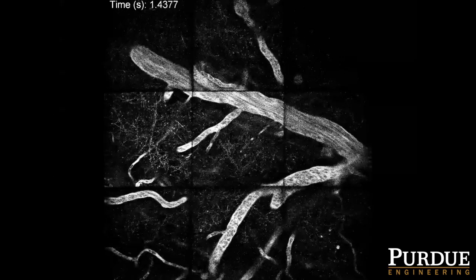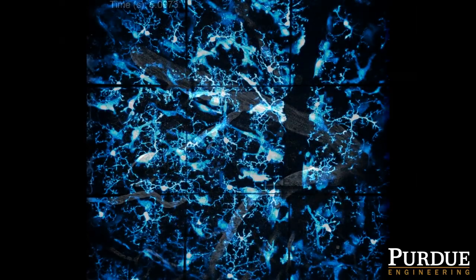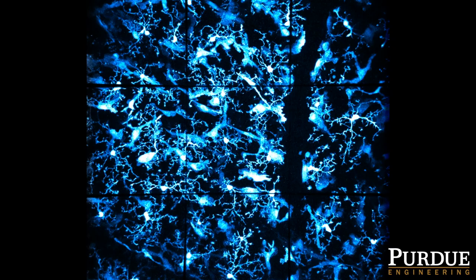And in this work, we use a 3x3 prism array to generate 9 pupils. Of course, this thing is scalable. You can potentially do a 4x4 or even a 5x5 to get 25 regions simultaneously corrected.